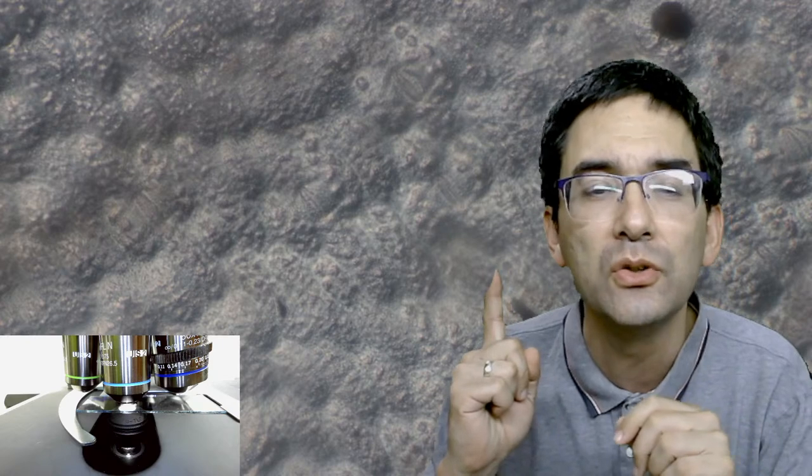Let me change the filter setting a little bit. I have a difficult time pointing to them, so I'm just going to use my finger. Look at this oval thing here - there's almost a line in the middle. Basically, these are two cells called guard cells, and there is a gap in between. This is where gases are able to go in and out of the leaf - carbon dioxide going in, oxygen going out.